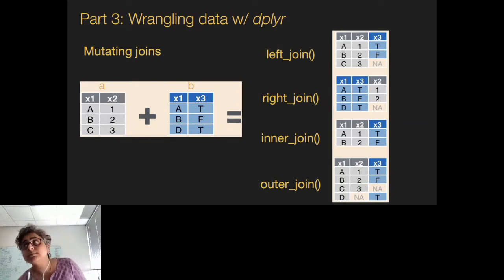There are other functions too in dplyr that I'm not going to be talking about, but feel free to explore. Again, there are cartoon versions of all of this in Tidy explained by Garrick.